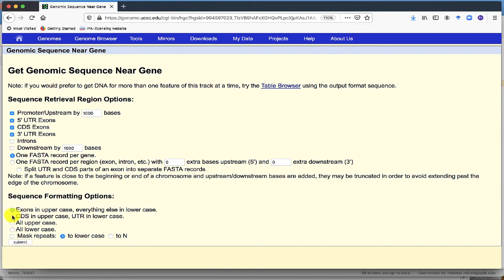So you can say, okay, I want to easily identify what are the UTR sequences in lowercase and the rest in uppercase. So you can check this option. You can submit.